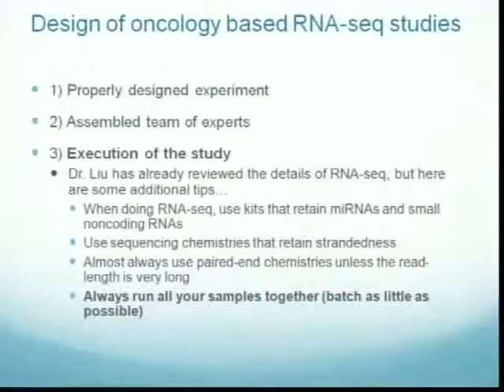And obviously, after we've got the experiment properly designed and we've got the experts assembled, you're going to have the execution. I know Yulong has probably already reviewed a lot of the details of RNA-seq, but I just wanted to give some additional tips. If you're going to do RNA-seq, you're going to extract that RNA, use kits that retain both microRNAs and small non-coding RNAs. Why this is important: right now with current next-gen sequencing chemistries, you either do the microRNA or you do the full-length transcriptome sequencing. If you ever want to validate microRNAs downstream, you'll need those microRNAs extracted from your original tissues.